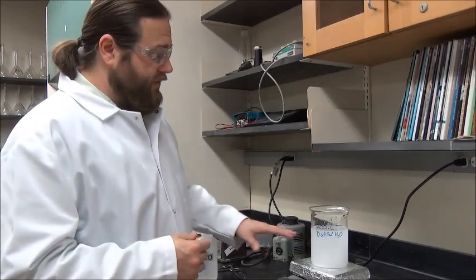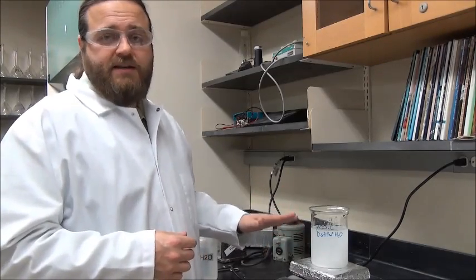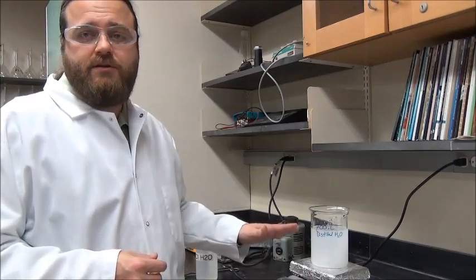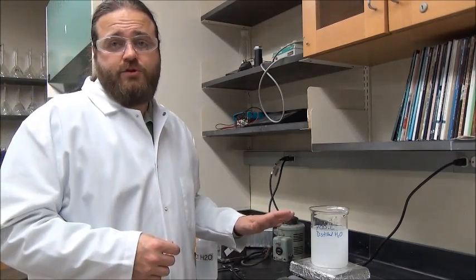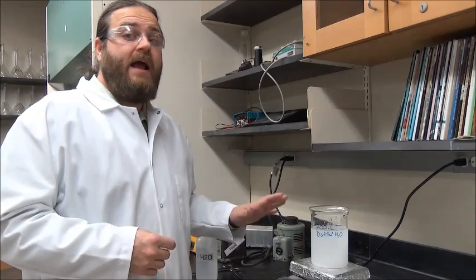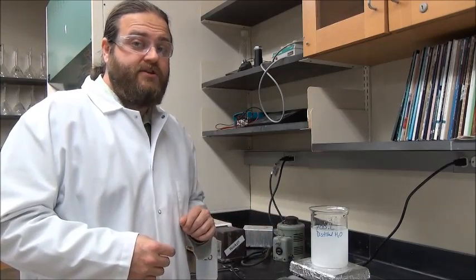The solution will become nice and crystal clear. That way we know that all of the alum - the potassium aluminum sulfate dodecahydrate - has fully dissolved in the solution, and we'll be ready to add it to our dish so that we can let it start crystallizing.